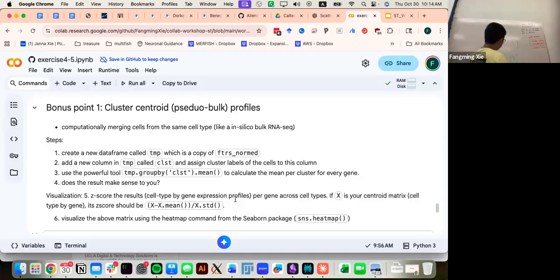But I guess it depends if you have replicates. Cluster 1 has animal 1, animal 2; cluster 2 has animal 1, animal 2. That becomes a bit more complex. We always have replicates, definitely. To do differential expression, I think you need to compute the centroid for each replicate, rather than a centroid for the entire thing. You might be tempted to do the centroid of the entire thing. That's okay as a report afterwards, but during the test you need a centroid for each replicate. That's just common sense, right?